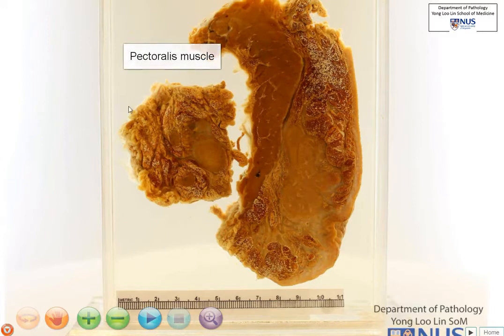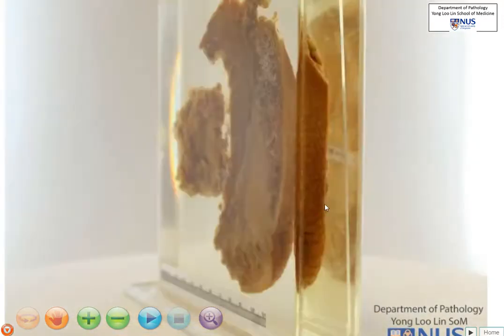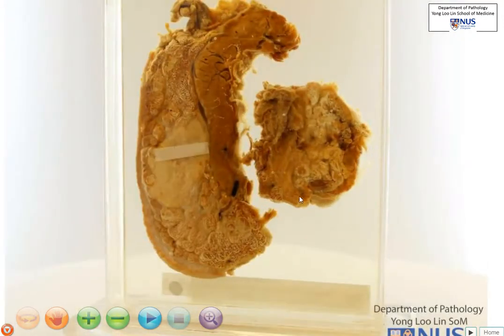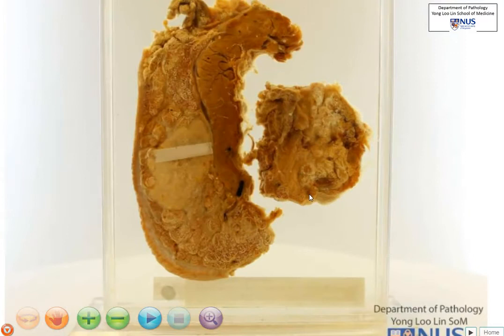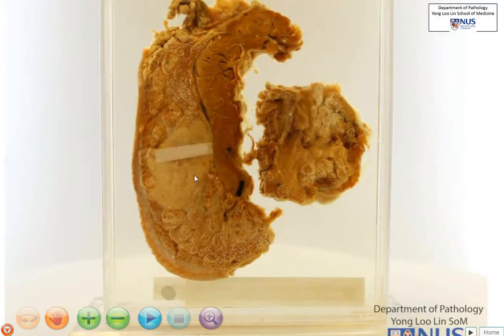I will leave you to figure out what this is later on. Let's just turn it around to have a look at the opposite surface. I think the pathology is much more readily seen on the opposite surface. Again, we have the pectoralis muscle, the breast parenchyma, and we have the overlying skin.